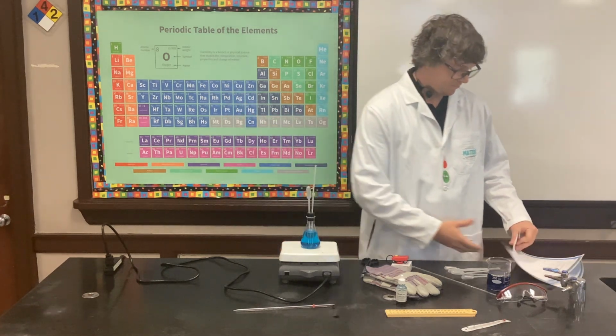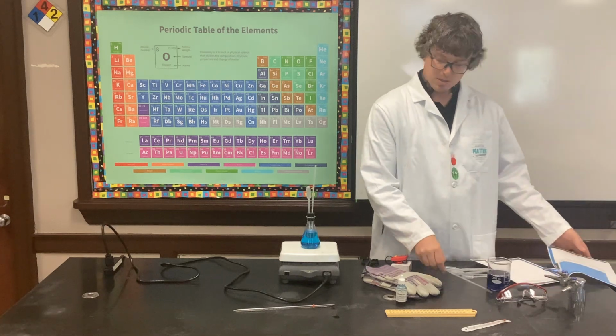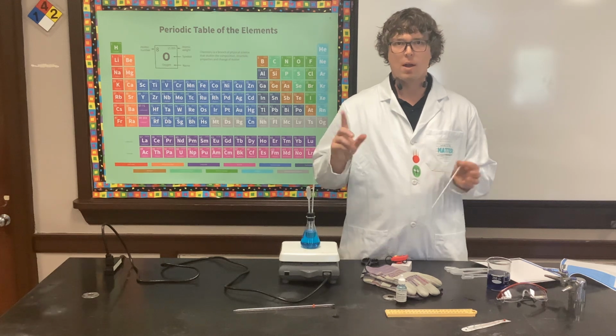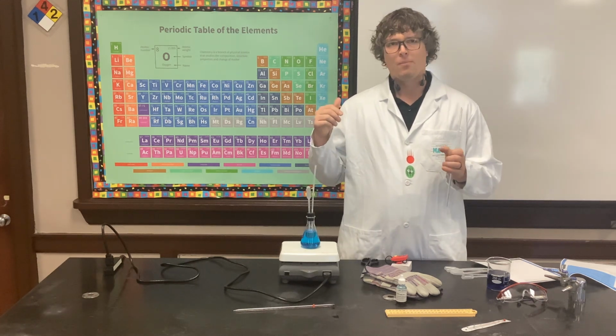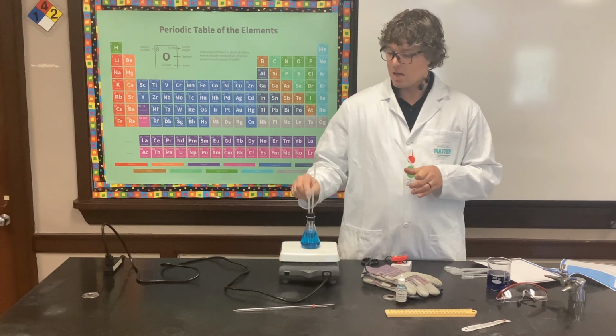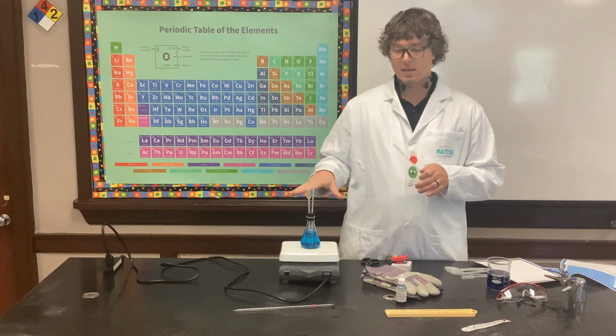In your materials list and instructions, it tells you to use this stopper. It asks for a one hole. I couldn't find any single hole. You could make your own one hole stopper if you get a drill from home. I talked about what I did.